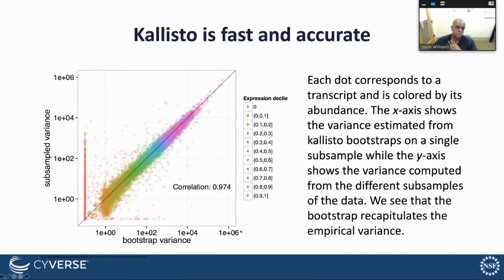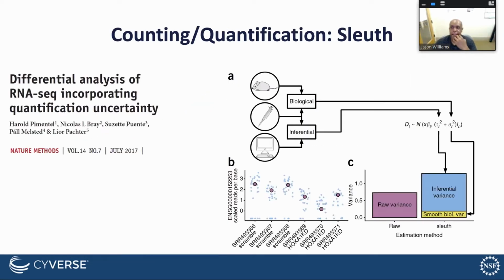So this is basically showing you that depending on the variance of the sample, you just get this linear correlation. Along the breadth of the possible variance between different subsamples of the data, you really get this nice linear path that shows that you're picking up, in terms of sensitivity, what you hope to pick up.